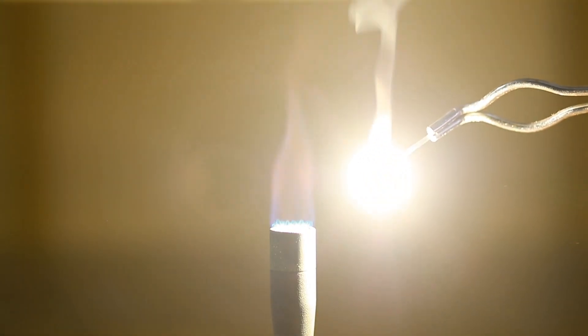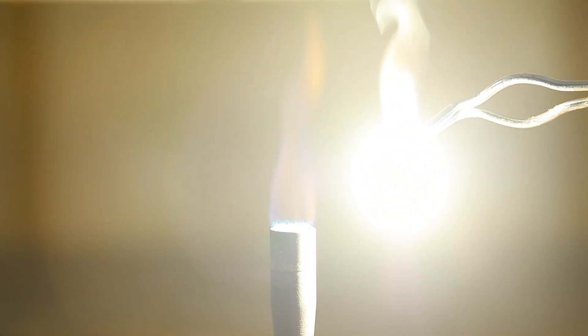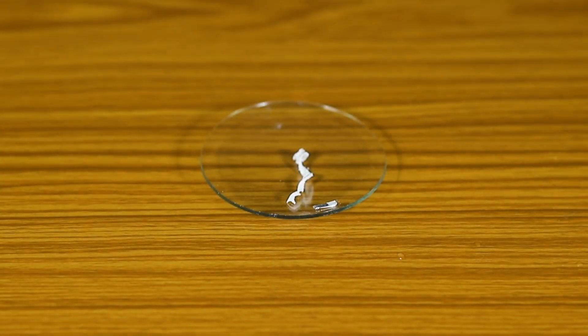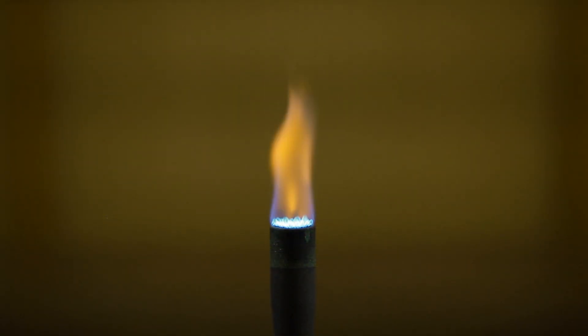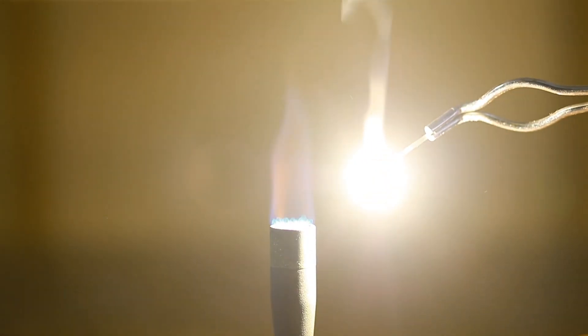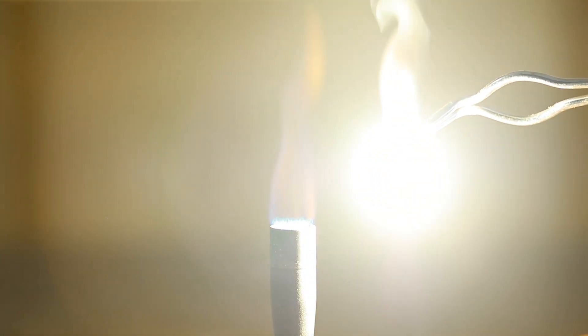What do we observe? We see that the magnesium ribbon burns with a dazzling white flame and changes into a white powder. When magnesium ribbon is burned in the air, it reacts with oxygen to produce white magnesium oxide (MgO), which emits heat and light.